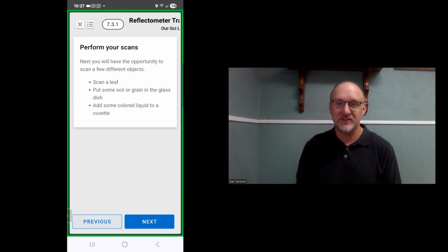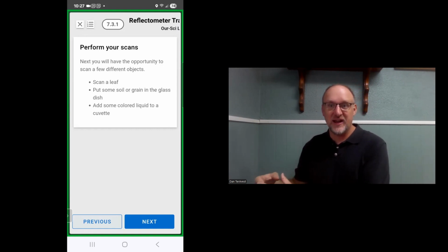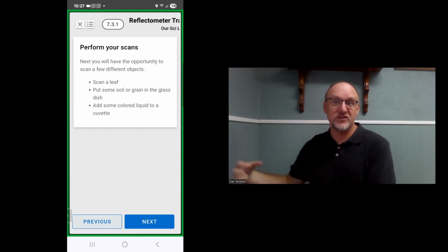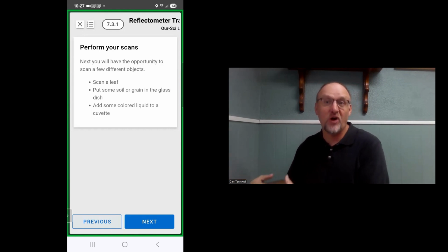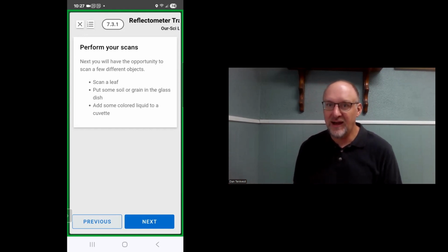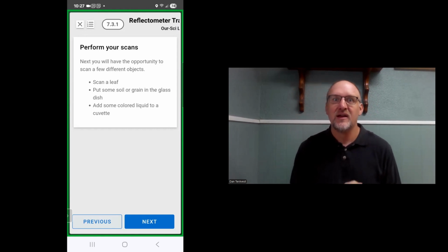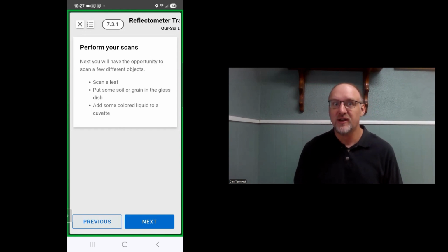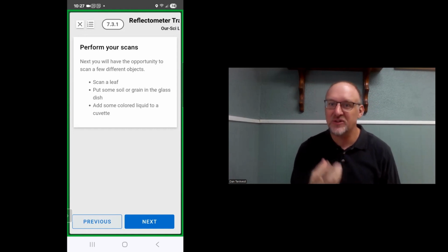And the second is to scan your soils and generate actual predictions or classifications based on calibration models that have already been created. So in that first case, that you're generating a calibration data set, there's a couple of key considerations. First is soil moisture. Moist soil will significantly affect the reflectance spectra of your soil.